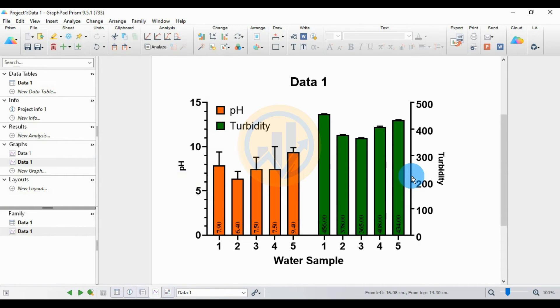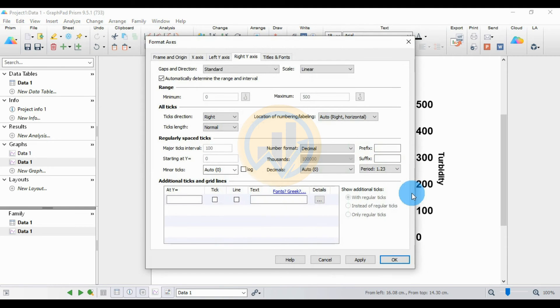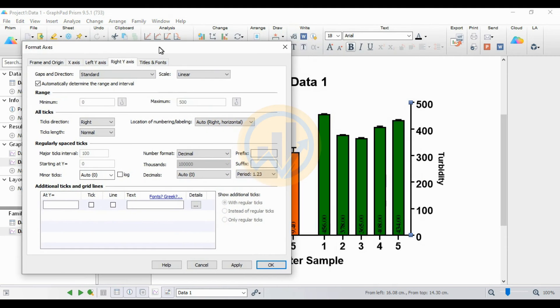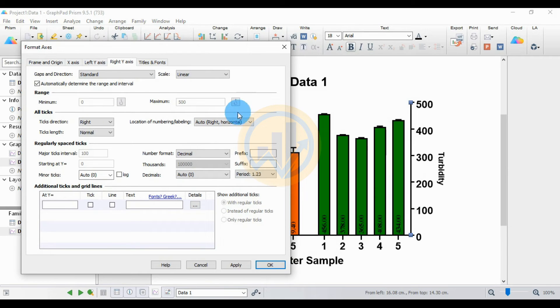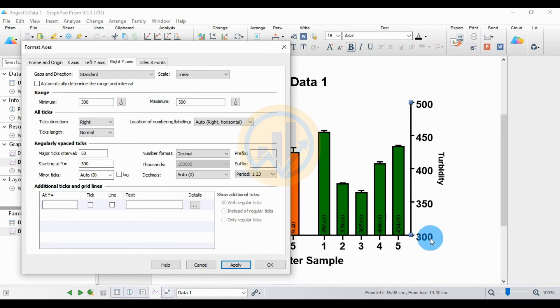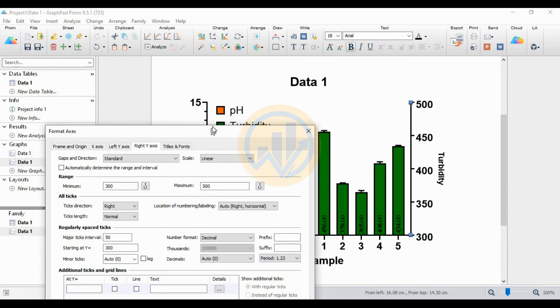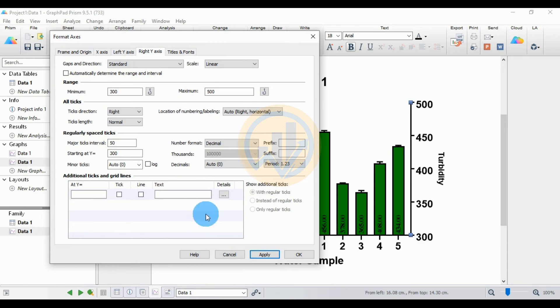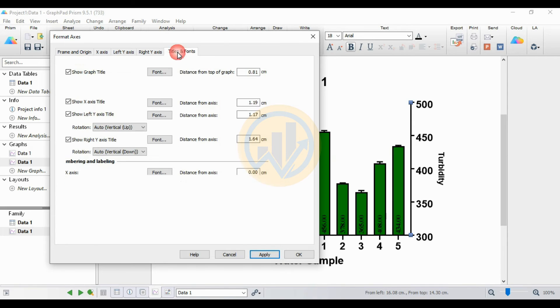Now double-click the left Y-axis to open the Format Axis tab. The range minimum is 0 to 500. Unclick the automatic determination checkbox and change the range to 300 to 500, matching our dataset. Click Apply, then OK. The axis now reflects the 300 to 500 range.